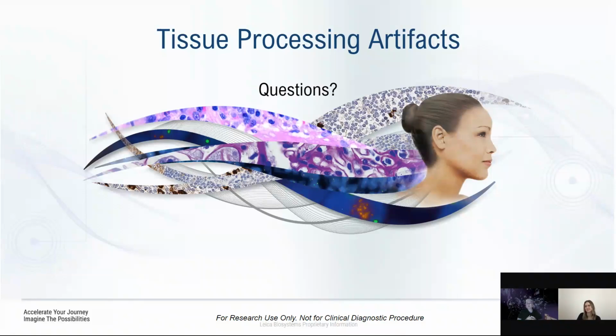Time stability for prepared tissue, would that be fixed or unfixed? Is that at the point of necropsy, or do I need to target that a little bit? Maybe I can talk about fresh tissue. Once you ligate, once you cut off the blood supply, we all know that at that point on a molecular level, changes are happening. If you're doing IHC with particularly phosphorylated targets, you need to rapidly get that into some type of fixative, PFA or NBF, and quickly. I think the time frame is less than 30 minutes.